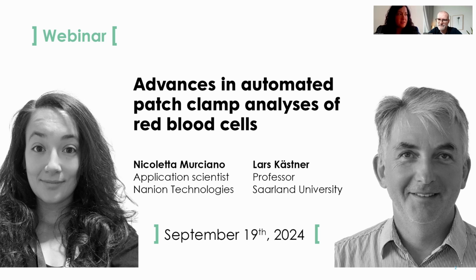I don't know if red blood cells are suitable for this kind of experiment, thinking also that the MB method is applied on a whole red blood cell population. So many cells replying at the same time, we can see the change in the membrane voltage. I don't know, it's something that I can try on a single cell recording.